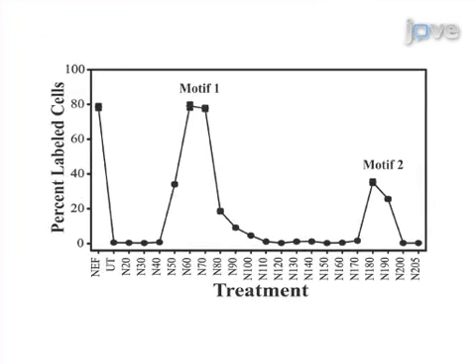The results obtained identify 2 functional apoptotic motifs in Nef.